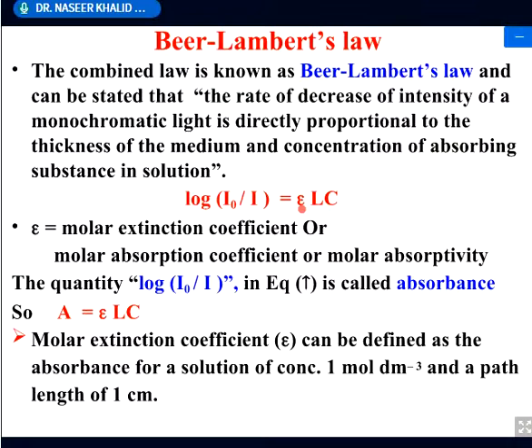This is the proportionality constant. This is known as epsilon, and this epsilon is also known as molar extinction coefficient. It is also known as molar absorption coefficient. It is also known as molar absorptivity.